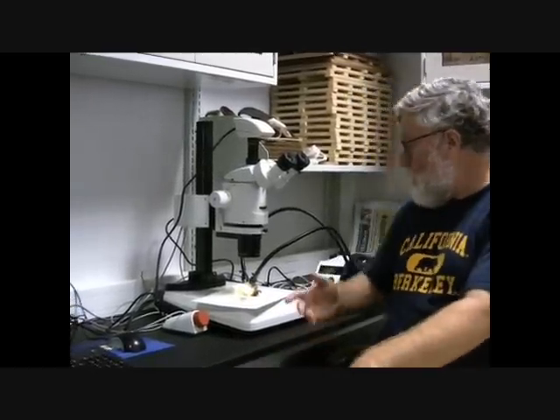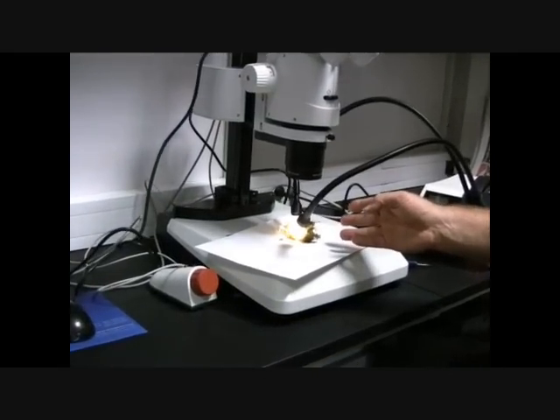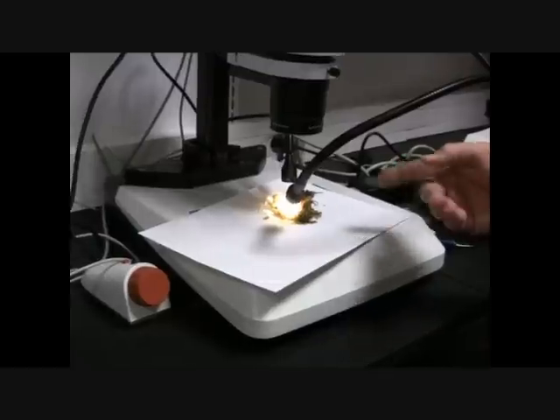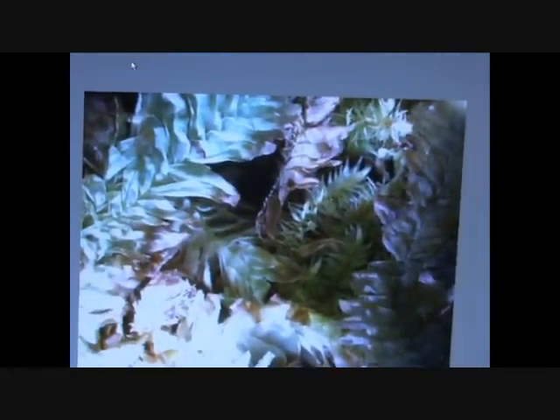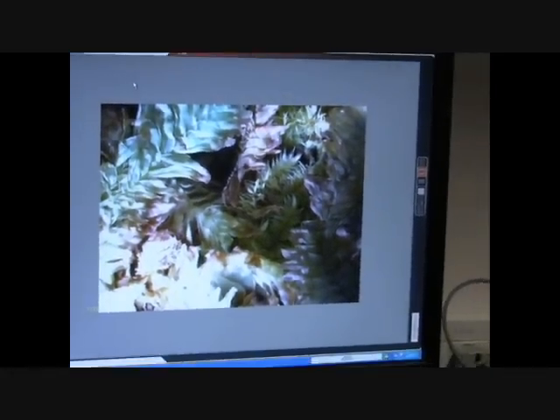One of the difficulties with these small plants is that they grow mixed together in the same environment. So what we're doing here is using the microscope to separate the different species and be sure that we sample them independently for their DNA sequence. If we look at a typical clump of mosses here from a very high elevation — this is from near the top of Mount Tujia, which is the highest point on Marea — and we look at them up close as projected on this monitor here, we can see that there are several different species all mixed together.